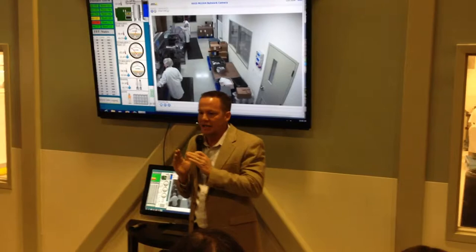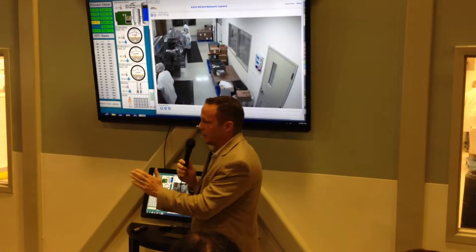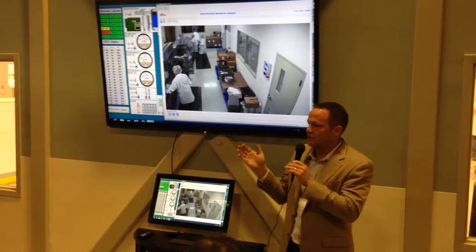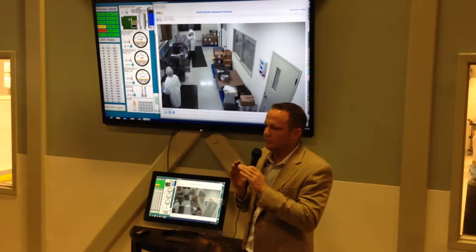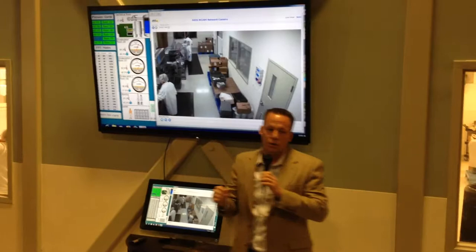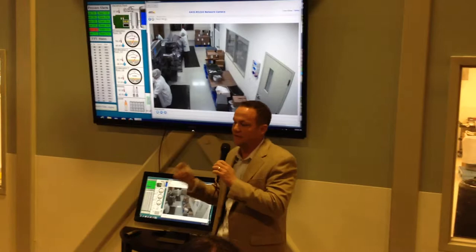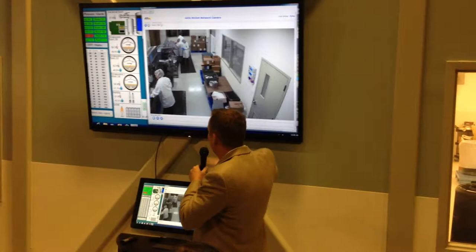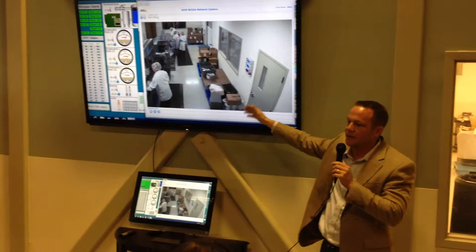Another really awesome feature is we can run XM-AM and XM-PM together — half on one side, the other product on the other side. It has a really fast camera that takes thousands of pictures a minute looking for defects. We teach the machine what each side's cap looks like, and if one of those caps crosses over, it tracks that card all the way through and kicks it out. If you're missing a cap or the cap is cracked or damaged in any way, it'll track it and reject it. So we get really high-quality products in our blister cards. That's why when we bought this machine, we knew it was the Ferrari of blister machines — we wanted the very best.